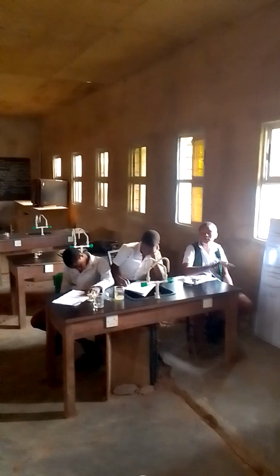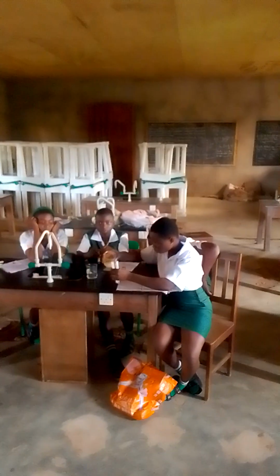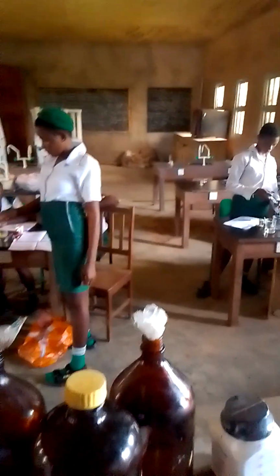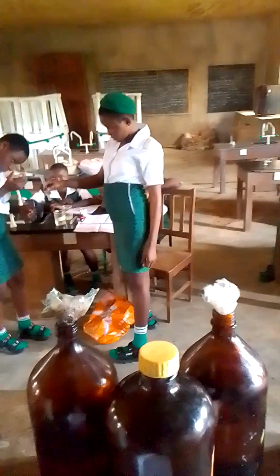You are going to divide your solution D now into two, using that test tube. Everybody has a test tube now. Then we are going to test it with sodium hydroxide, in drops. Pour it into the test tube. Drop it into that place, drop by drop, and observe what is happening.